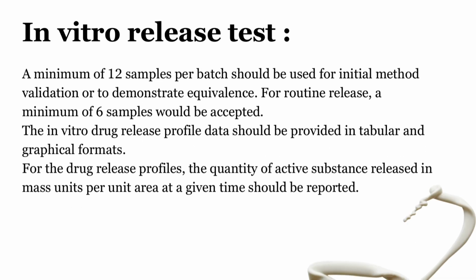In vitro release test: a minimum of 12 samples per batch should be used for initial method validation or to demonstrate equivalence. For routine release, a minimum of 6 samples would be expected. The in vitro drug release profile data should be provided in tabular and graphical format. For the drug release profile, the quantity of active substance released in mass units per unit area at a given time should be reported.